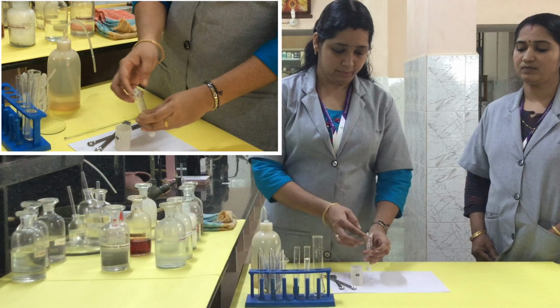To the salt solution, you have to add concentrated nitric acid. That means 1, 2 or 3 drops of concentrated nitric acid are added to the saturated solution of the salt. Then shake it well.